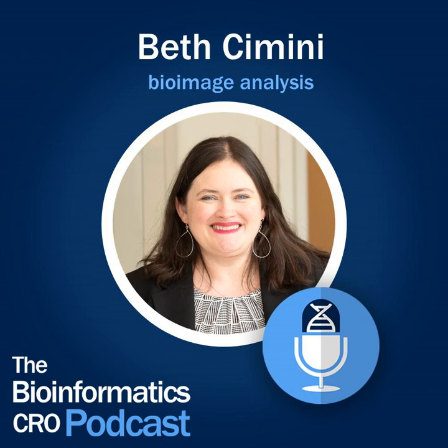But really, we've estimated from some very back of the envelope things that we think probably about a third of biologists do some sort of light microscopy. So it can really be almost anything.